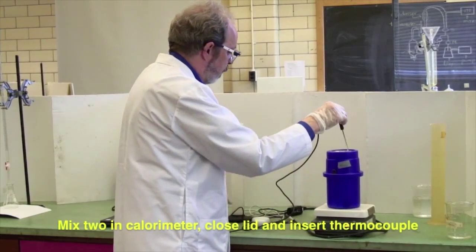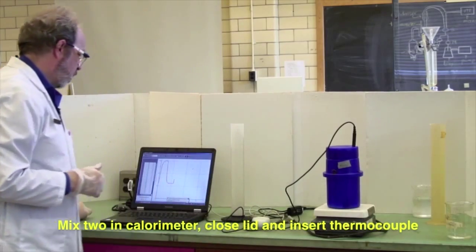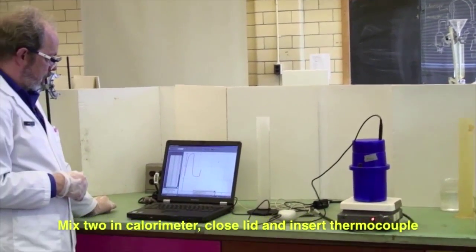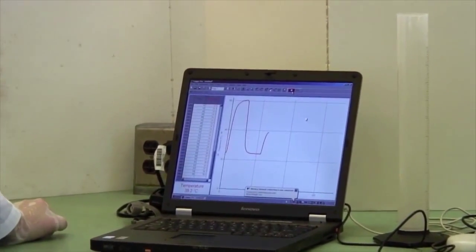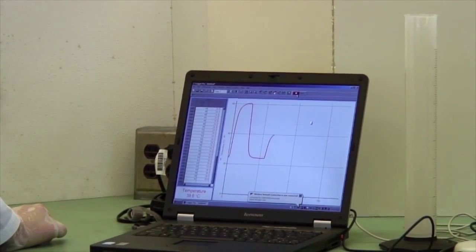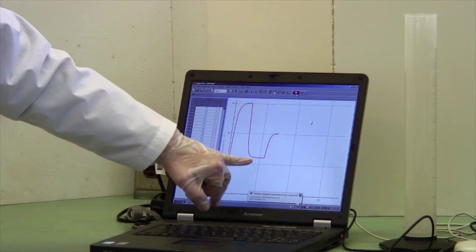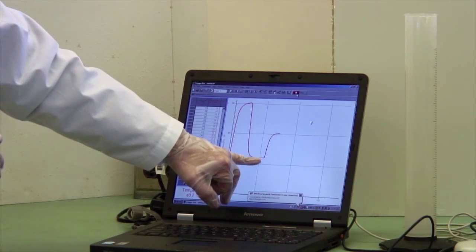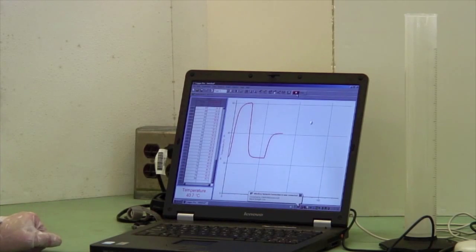Make sure everything has come out. Put the lid on. Put the thermocouple through the hole. And wait until you get a steady temperature. So, here we have the high temperature of the hot water. This temperature down here is the cold water. And we've now got a pretty steady temperature there. It's 40.7. And that is the temperature of the mix.